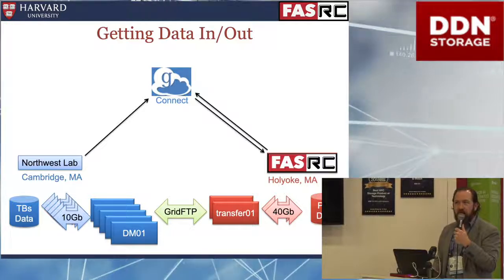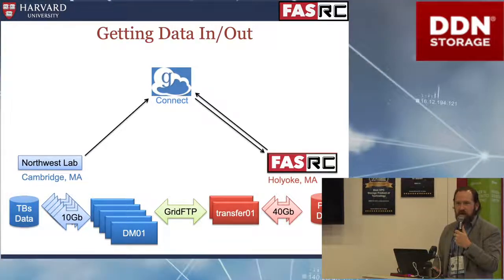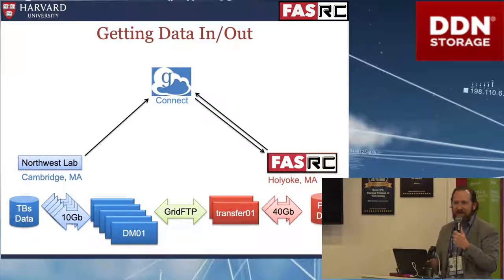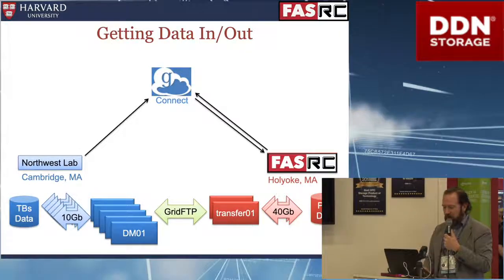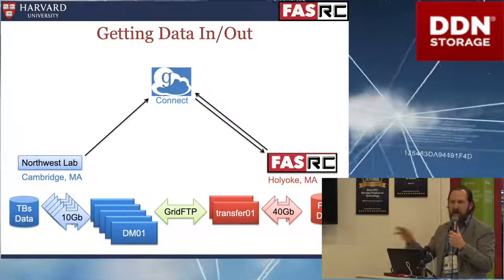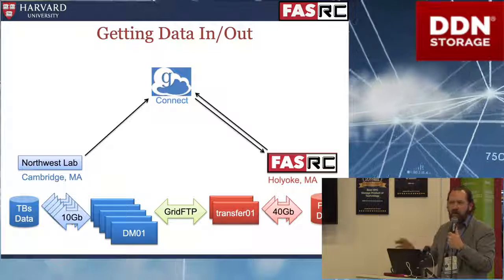And how do we get the data to the compute cluster? Well, I'm trying to convince them all to stop doing this manually with rsync. My friend Ryan in the audience is doing some cool stuff with Globus with this product called Automate. We're trying to do stuff like that, where when the data comes off the instrument, a task could pick it up and move it. Maybe it requires some kind of first quality control, and then they would move the data.